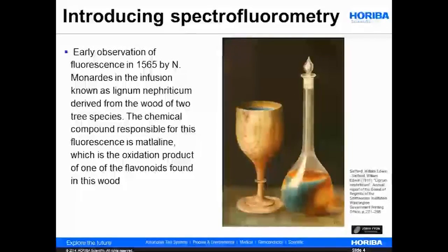Nowadays, fluorescence is a well-known technique in the toolbox of modern researchers. Based on the interaction of light with matter, it presents various advantages in terms of sensitivity, selectivity, ease of use, and limited sample preparation. But fluorescence is not really a recent phenomenon.